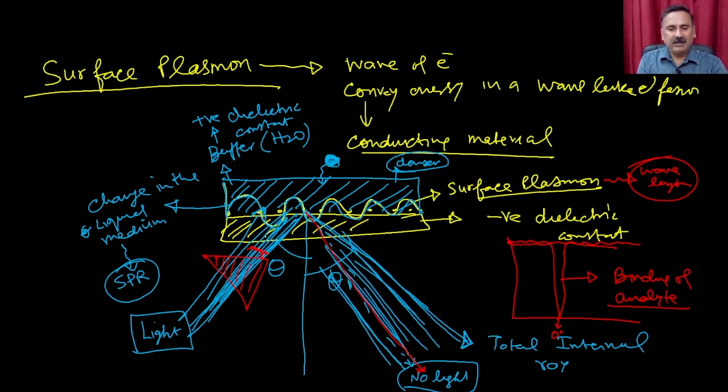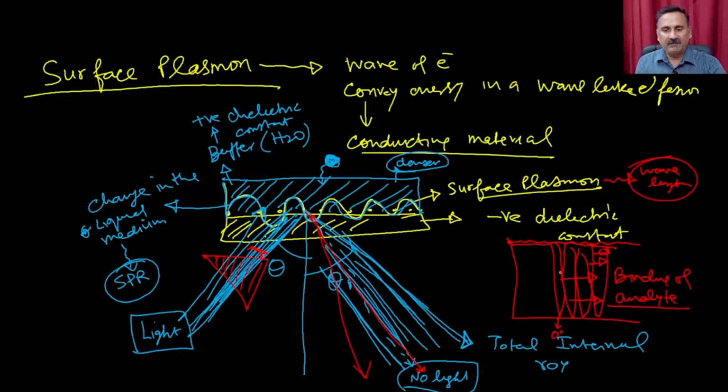So when there is a binding, the angle is going to move to this side. Okay, this means you will see a binding, right? You will see another binding, and another binding. So it will keep shifting as the molecules are binding, because if one molecule binds you will see one shift. If another ligand binds, you're going to see the binding. Anyway, I'm going to show you in the next slide how it happens.